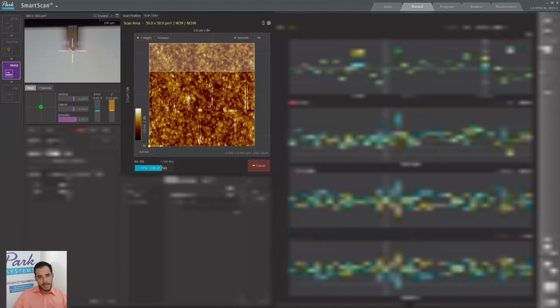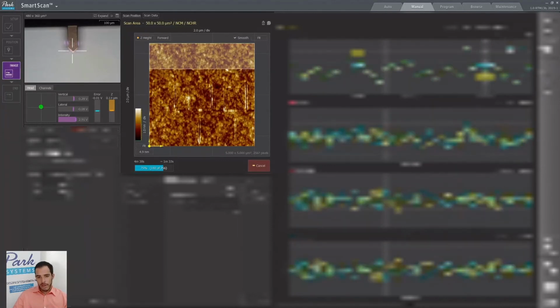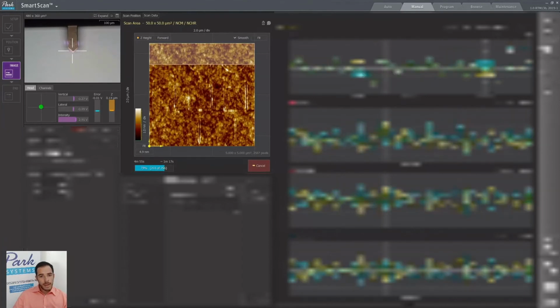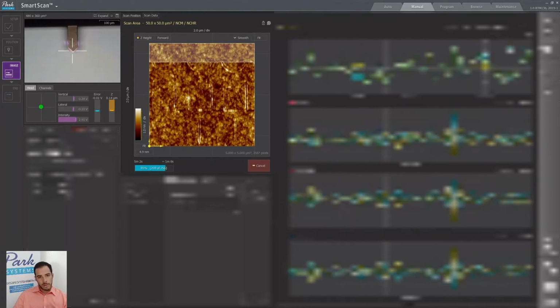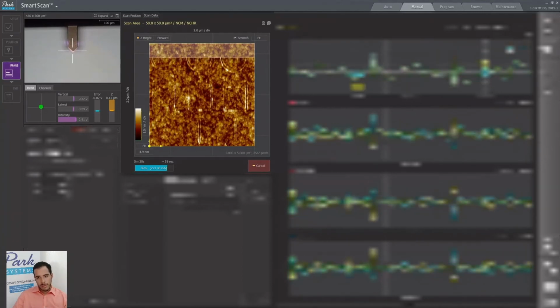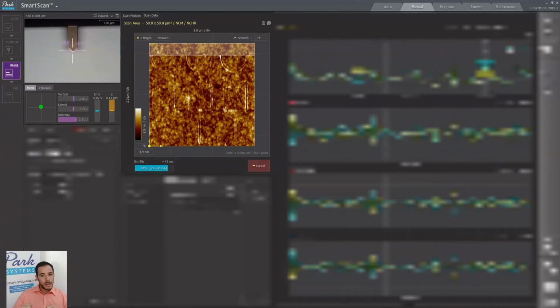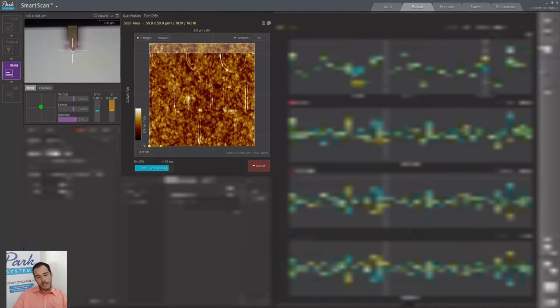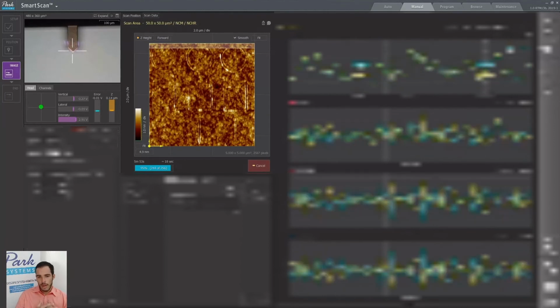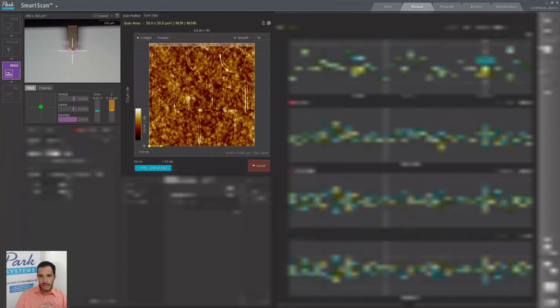It has the same phenomenon as the lines. The left one is not as clear as the right one, but it's because of the amount of force we have just applied. And we can finally start seeing the circles in there. You can also see the 6 grooves that are formed, 6 because there are 2 per circle, right? And we just have to wait a couple of seconds before we can proceed to analyze our image in our analysis software, which is called XEI.